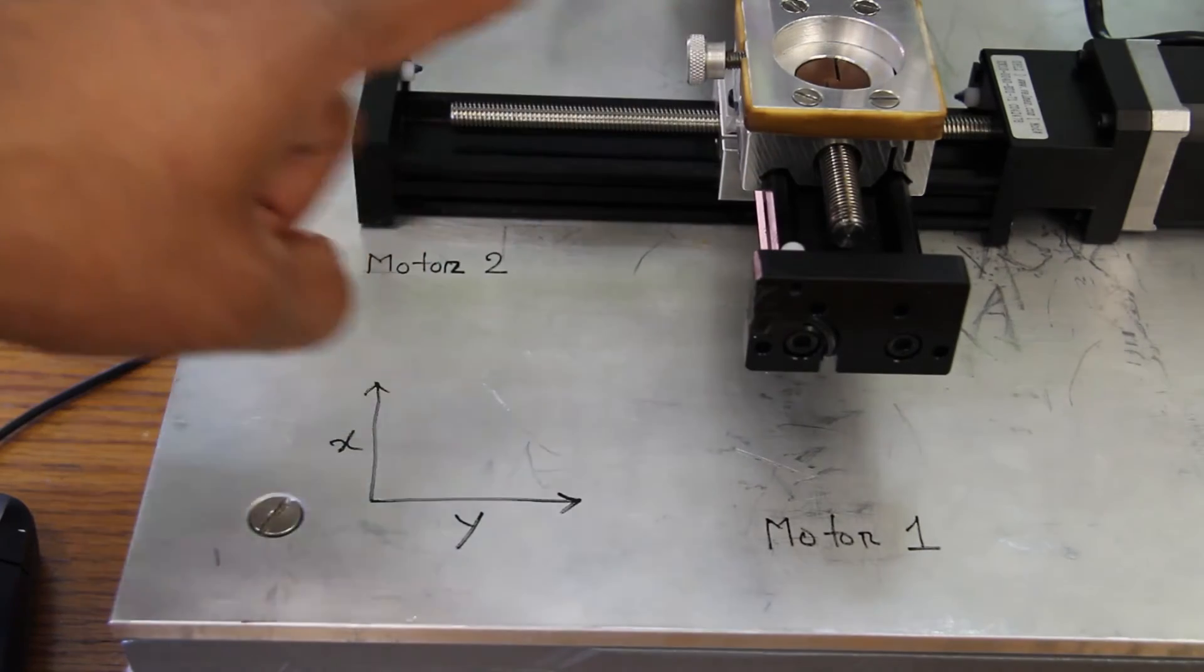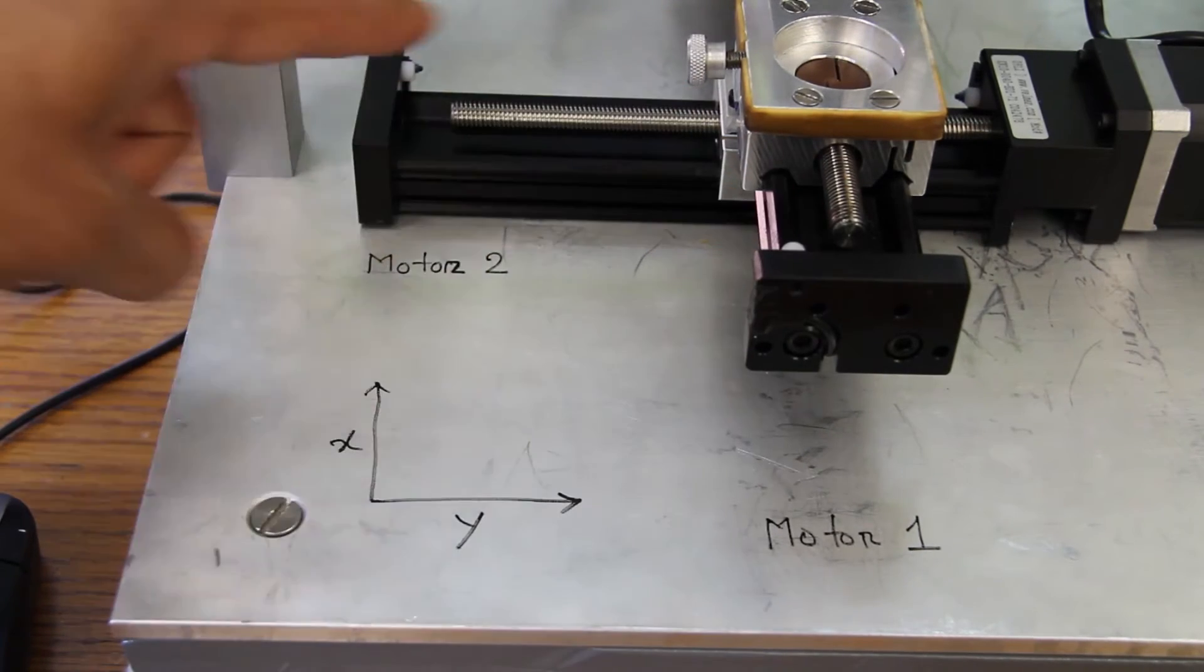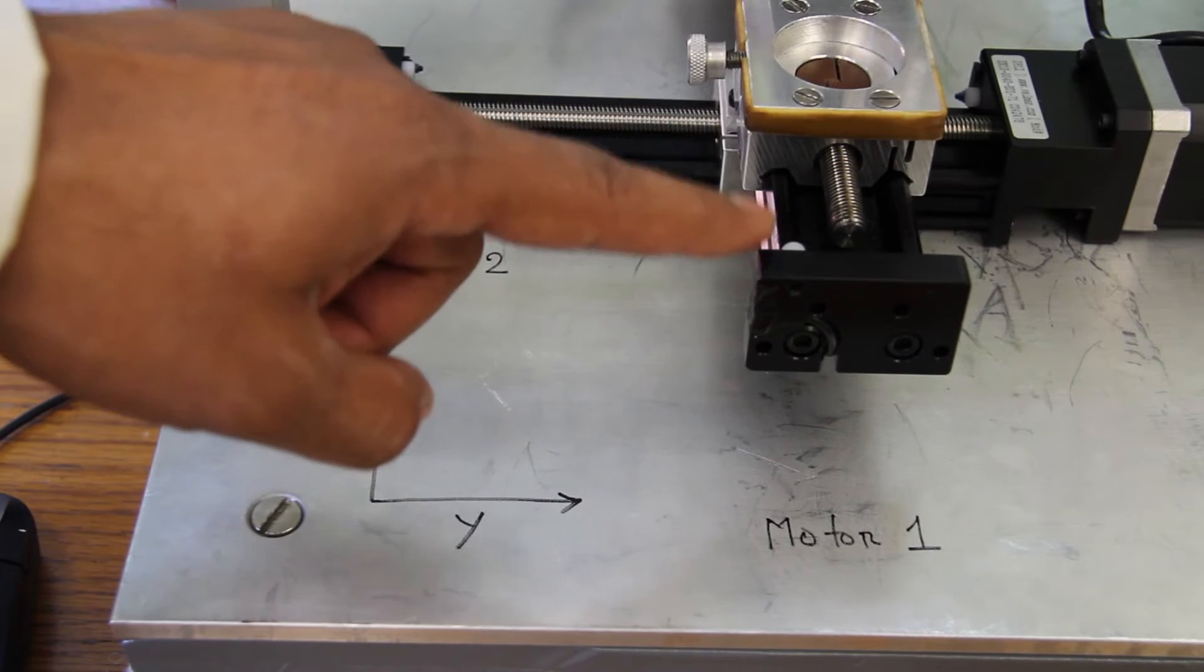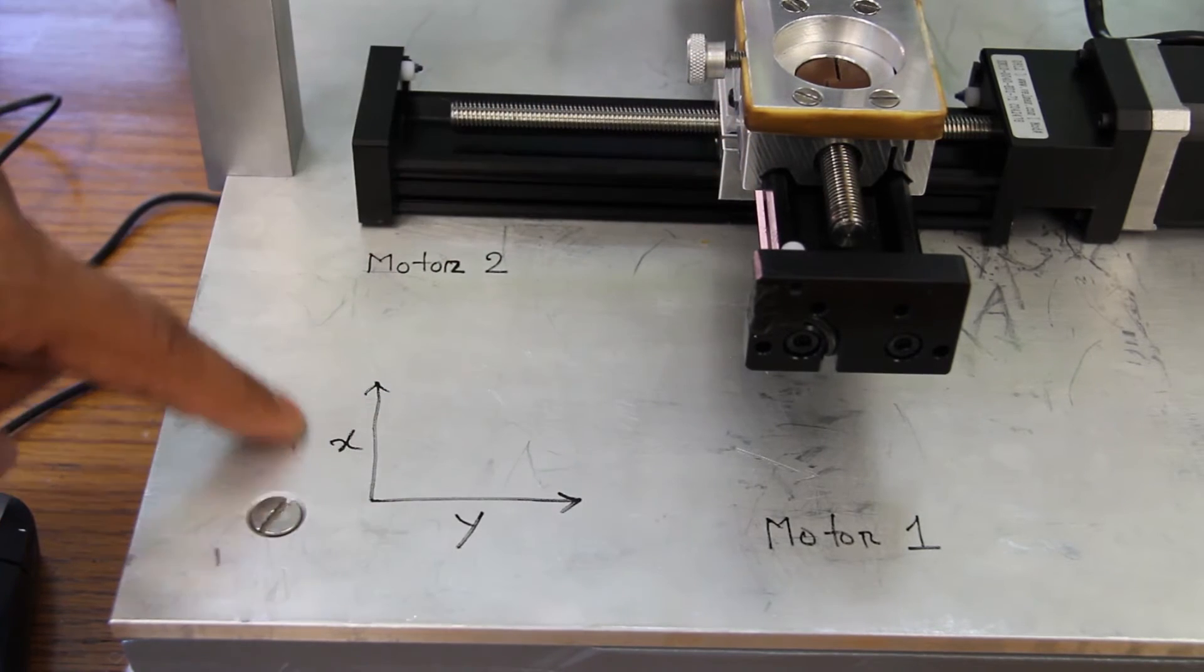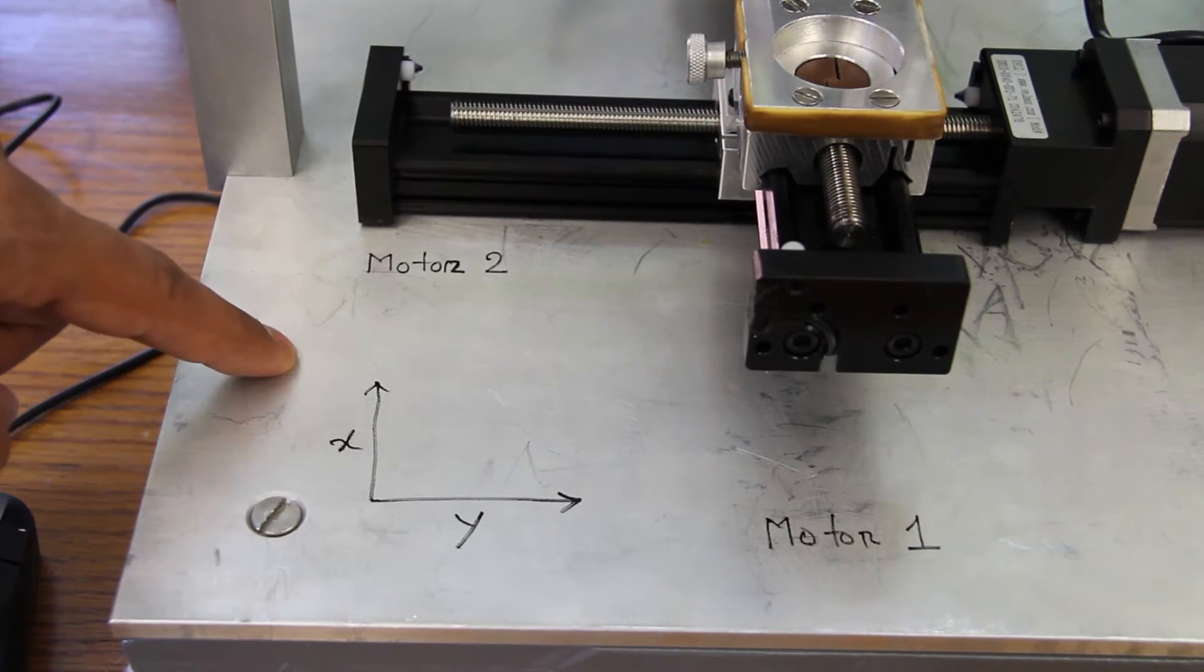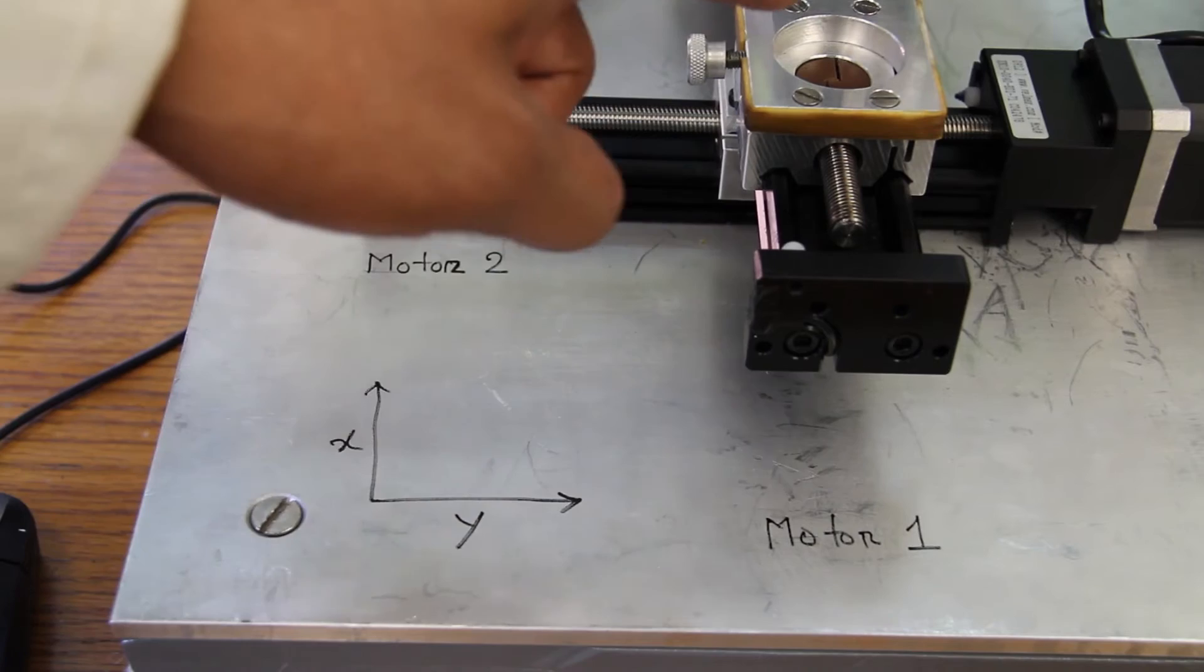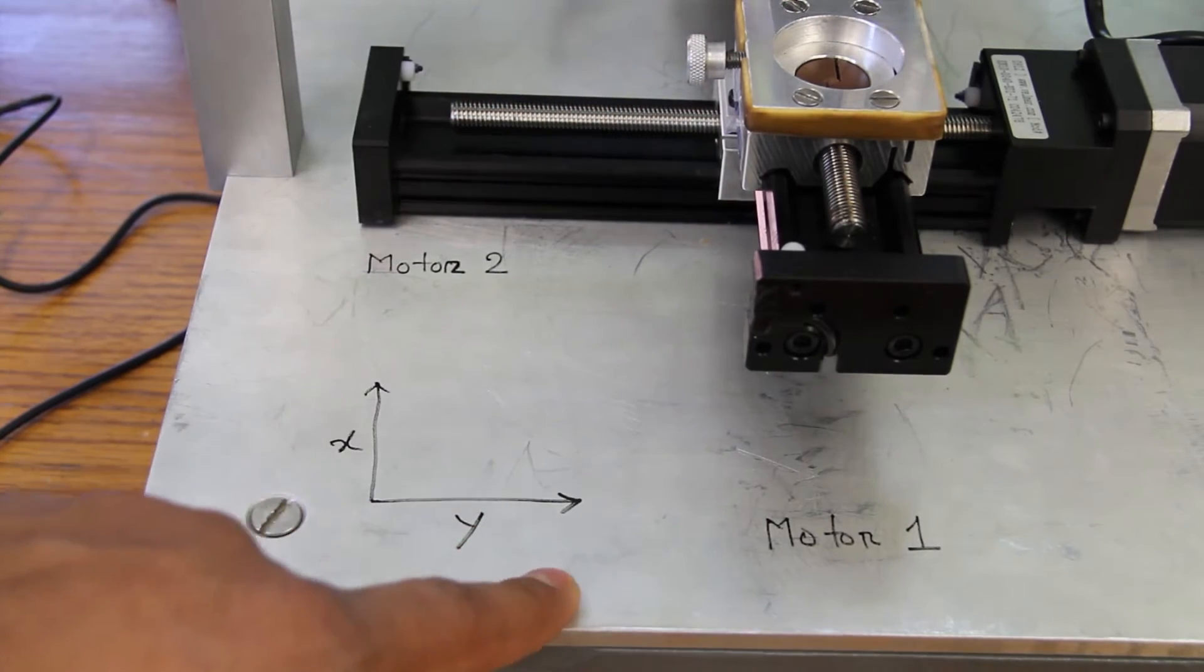We have two stepper motors. This is motor 1 and this is motor 2. Motor 1 moves the sample towards the X direction and motor 2 moves the stage towards the Y direction.